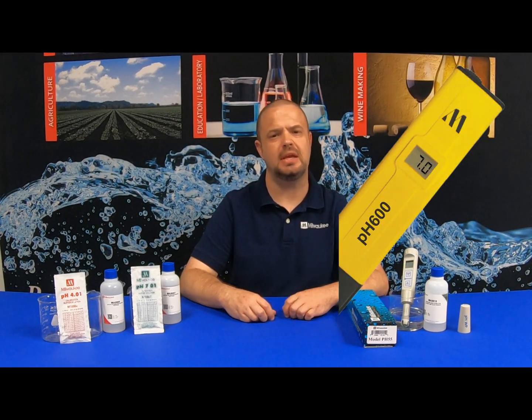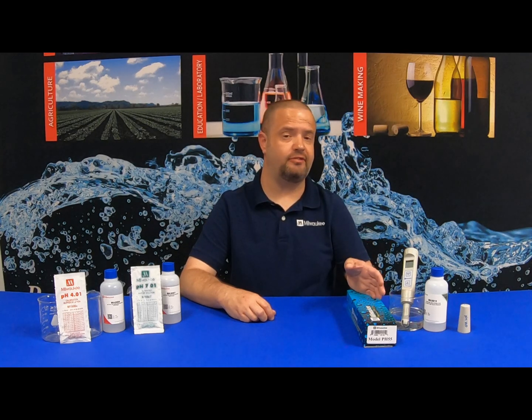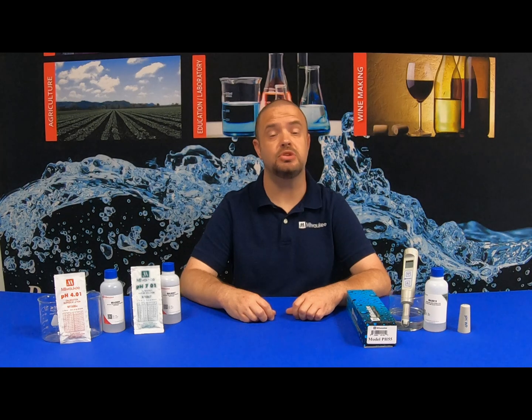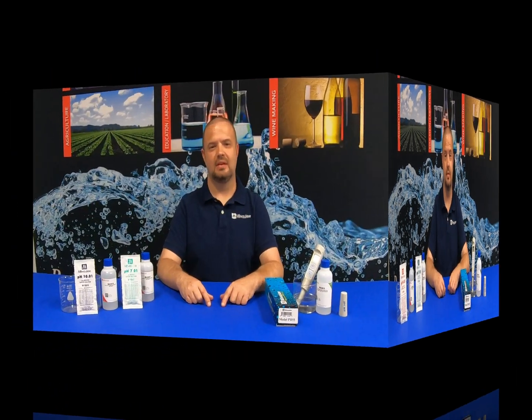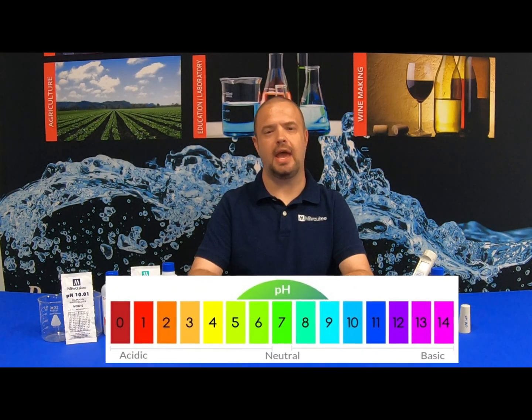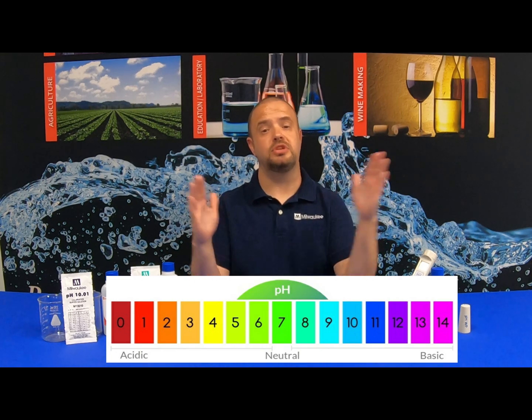In a previous video, we discussed the Milwaukee Instruments PH600, which had a one-point manual calibration. The PH55 is a step up above the PH600 as it features automatic two-point calibration with temperature compensation. What's the difference in a one-point versus two-point calibration?